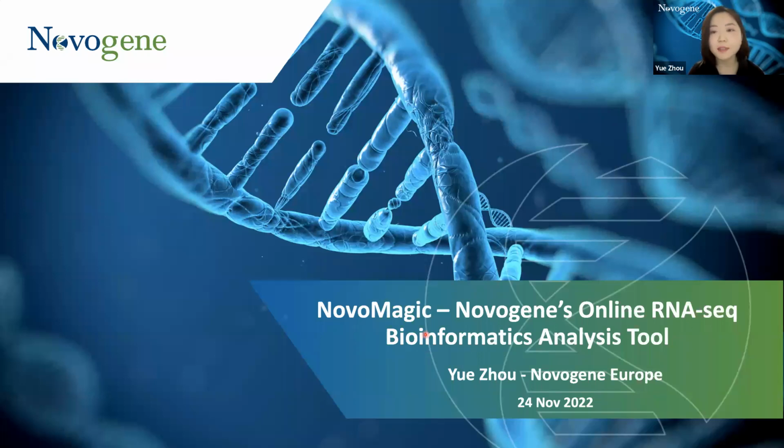Today I'm glad to introduce you to NovoMagic, which is Novogene's online RNA-seq bioinformatic analysis tool. Before we start the talk, I'll let you know that today's talk is not about coding. It's more related to the introduction of this online platform and how to use it. So NovoMagic is an online RNA-seq BI tool for the Novogene client. I know this is very different from the previous beginner's guide educative webinars that we run, but I will also use the standard analysis of RNA-seq as example, guiding you through the functionality that NovoMagic covers.